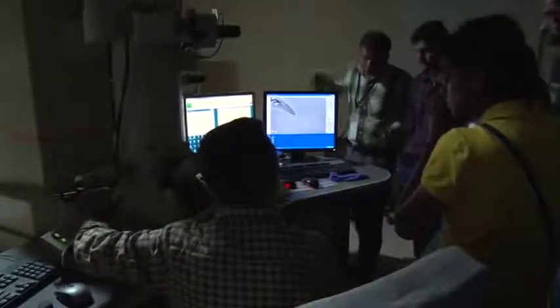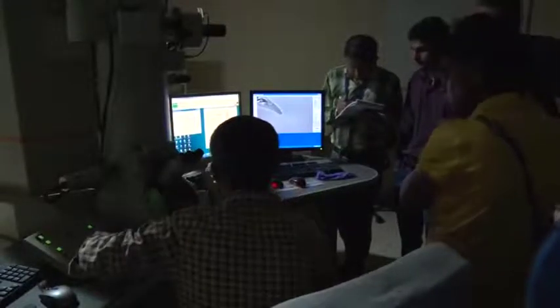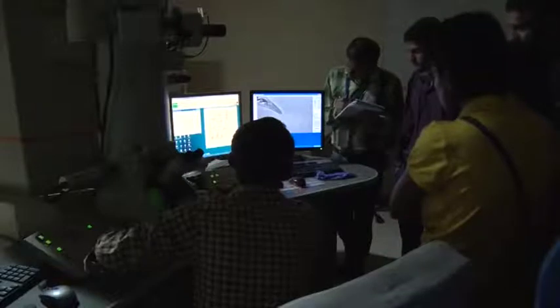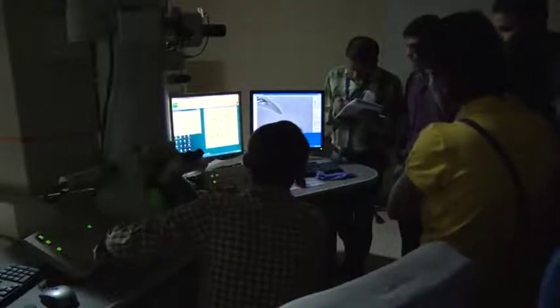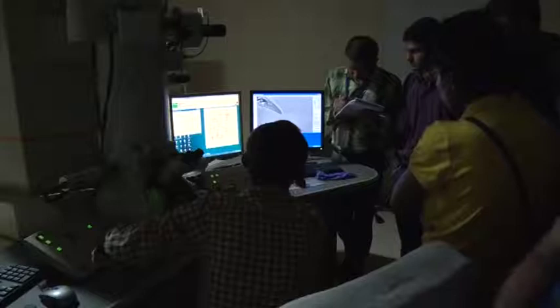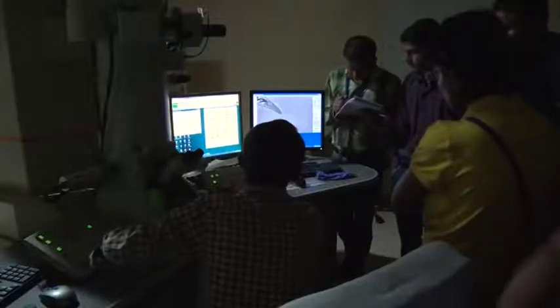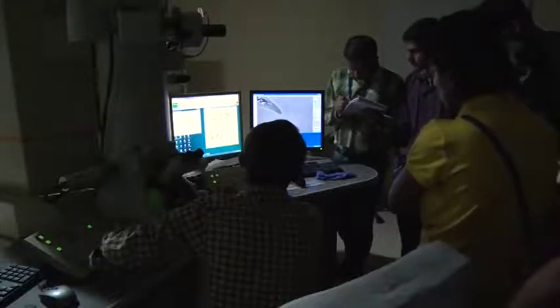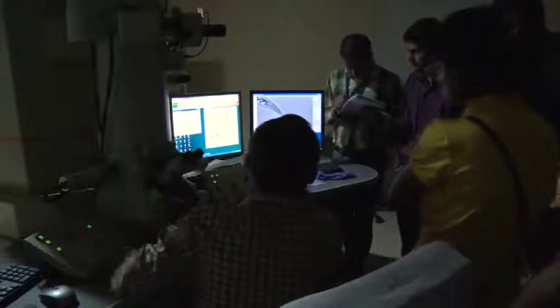We will not probably correct it, but if we want to correct, then one has to go to objective stigmator. Once I press that, the bright field has gone, automatically it goes there. And now, using these deflection stigmator knobs, one can try to correct it, for example. So let's do it, if it helps a little bit. Okay, so this is one way of doing it.